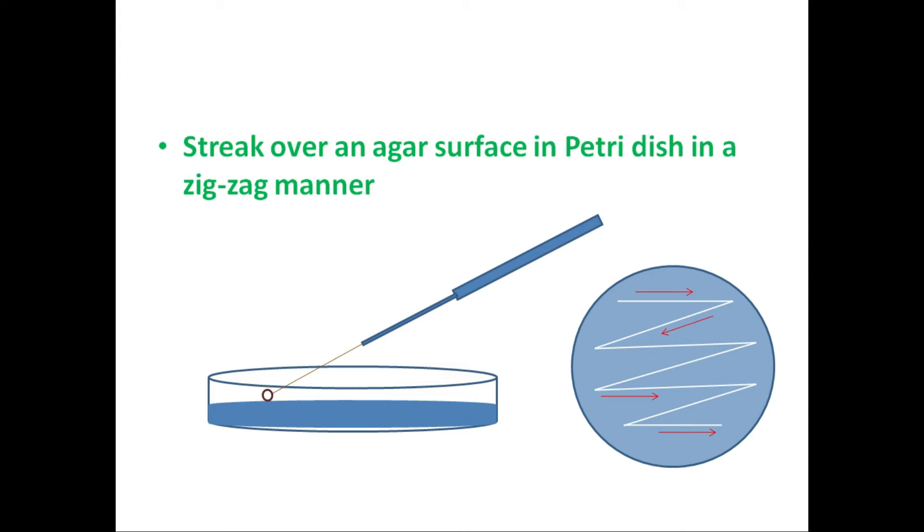With the help of the inoculation loop, you have to touch the surface of the medium and then drag the inoculation loop in this direction, making imaginary lines. You should not lift the tip of the inoculation loop in between — you touch the inoculation loop here, go on making streaks, and then finally lift it when streaking is over.